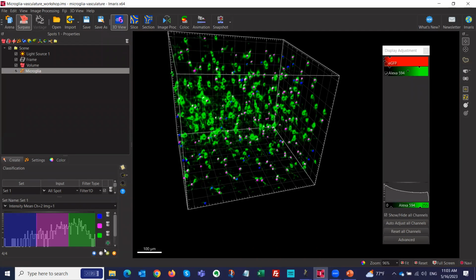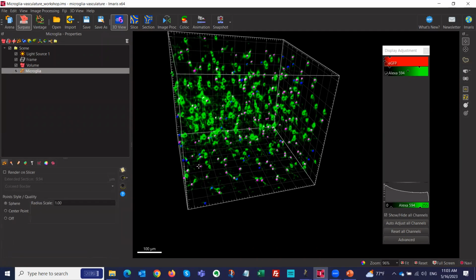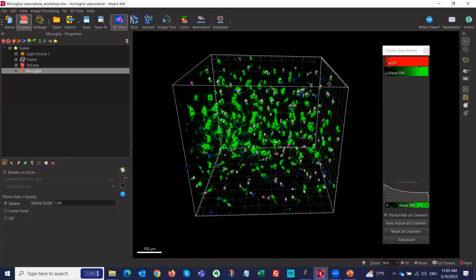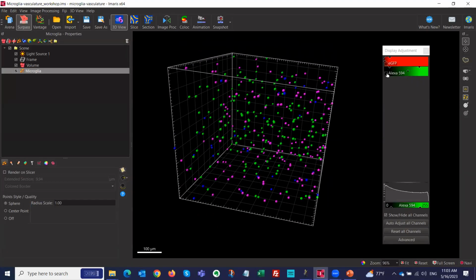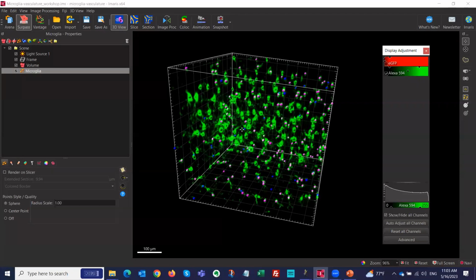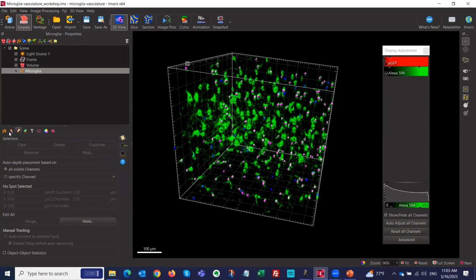Like this. And then I can finish this up. And this is my spot object. It's finished now. I have a distribution as well of intensity values in the green channel. And once I finish this, you see a bunch of tabs appeared here.